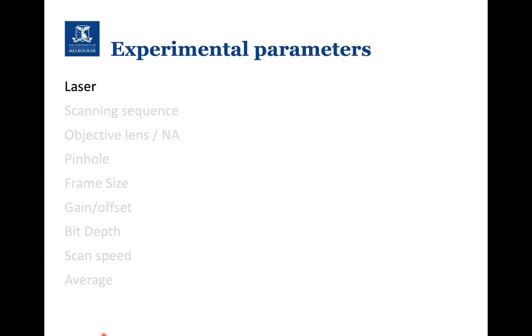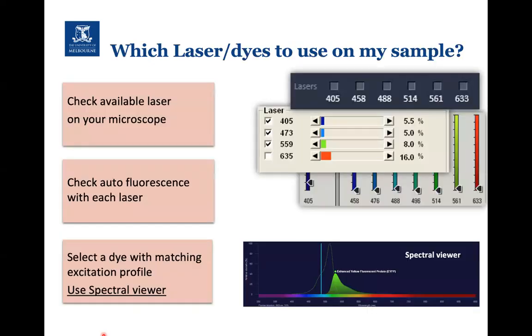Okay, so let's start with laser. Each instrument will come with slightly different setups in terms of lasers which are available. It's a good idea to check that before you get to the instrument.